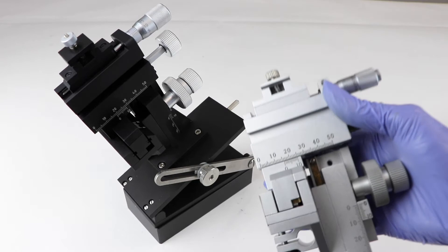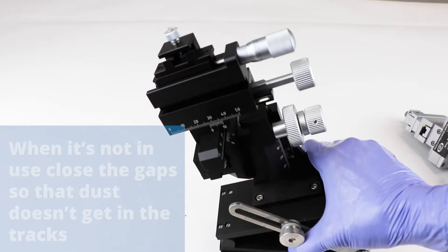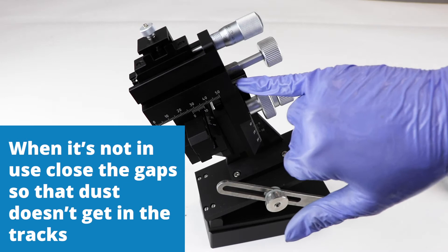When handling a micro manipulator like this, always set it down carefully. Dropping it even a short distance can damage the general alignment and the adjustment.